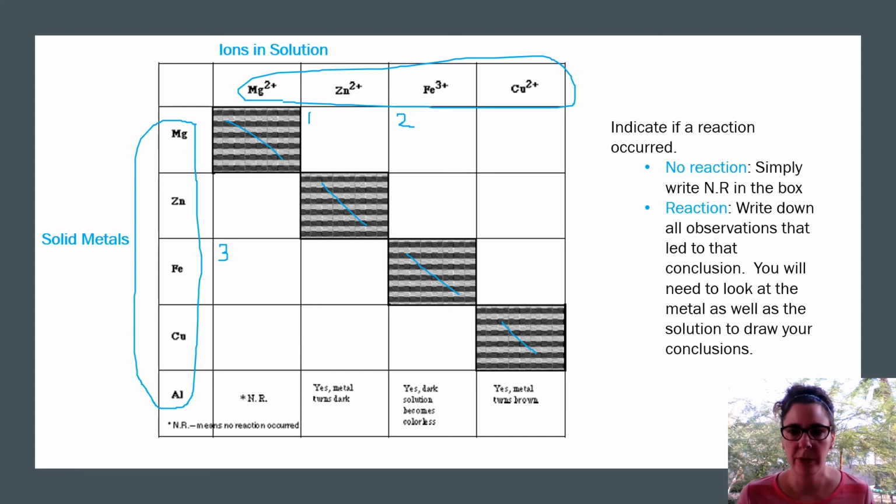So what should you be recording? Well, one option is that no reaction occurs. If that's the case, just like we see in our example, I'm just going to write NR, no reaction.